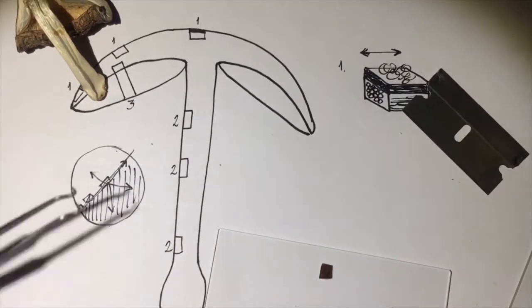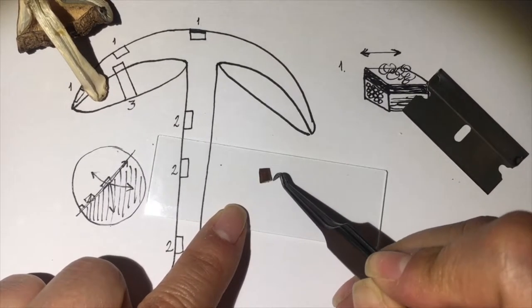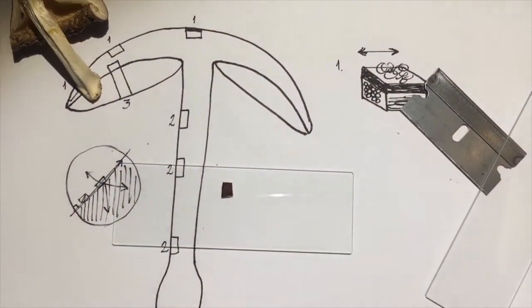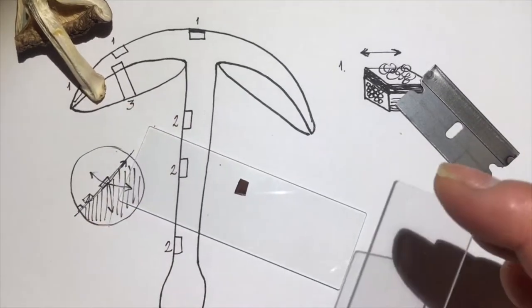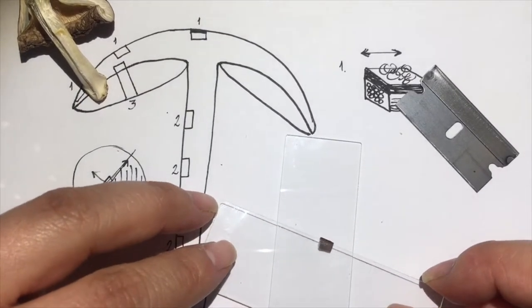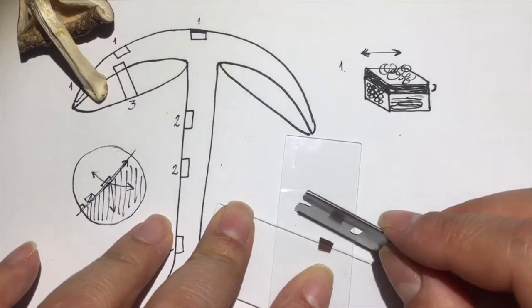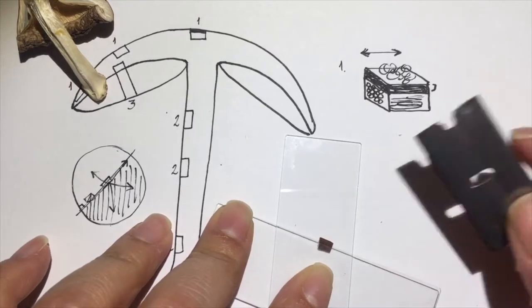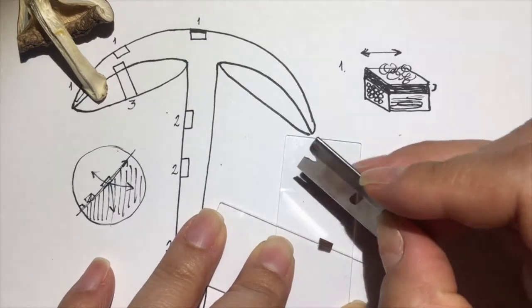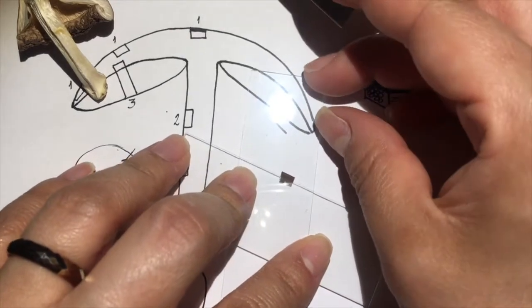So keep in mind that this is now radial. This is not radial. And the trick here is, I'm going to do it this way just to show you. I'm going to hold it down with this, and then I'm going to use the blade like you're chopping tomatoes, garlic, whatever. The first cut is just to create the direction, and I discard that. This is obviously too big. If you can see it, it's too big.